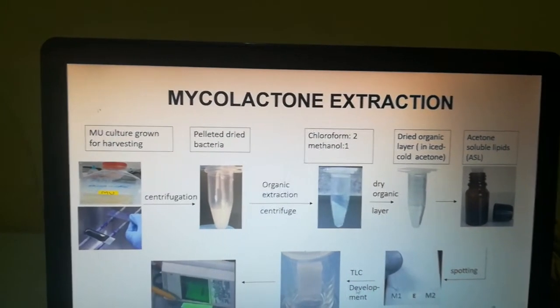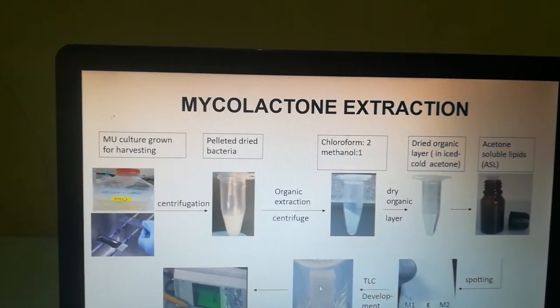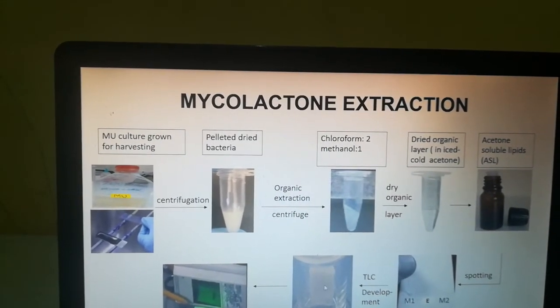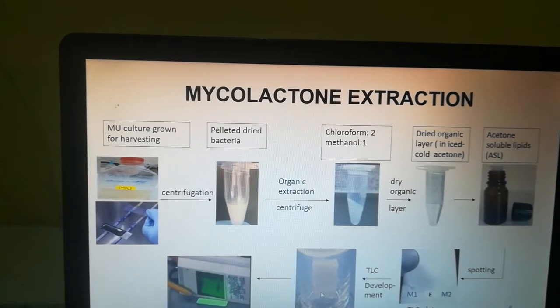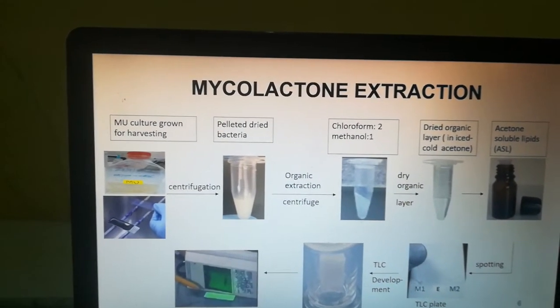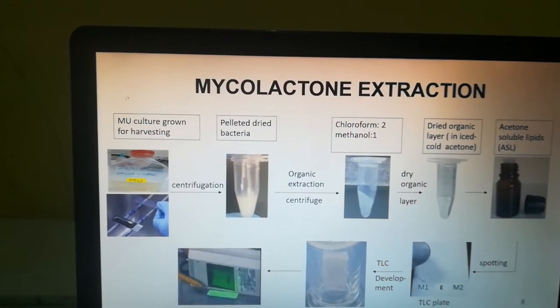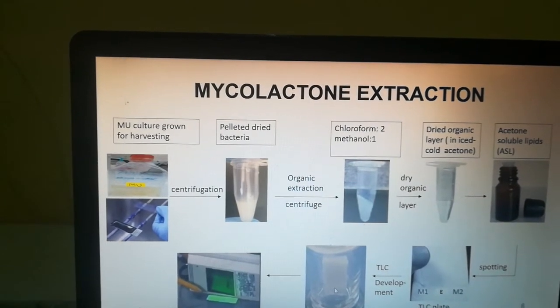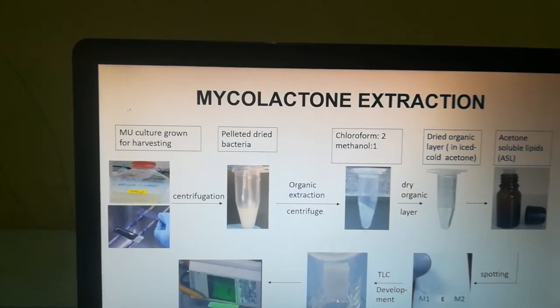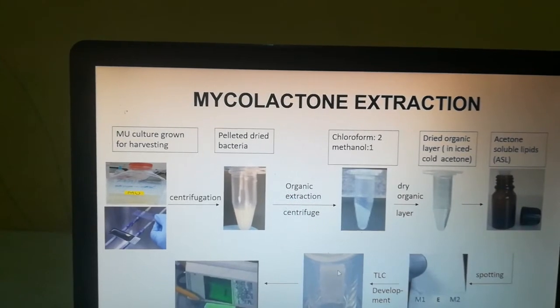Once that is done, you then put the silica gel plate into your solvent system, which will comprise chloroform, methanol, and water in a ratio of 90:10:1. And once you find the solvent system migrating across, always make sure that the line of origin is above the solvent system. You let it migrate till it gets to the end point, then you remove it.